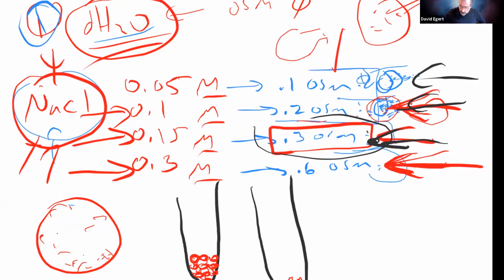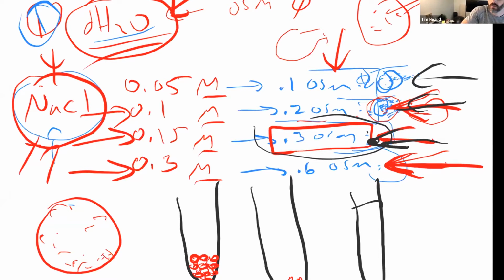And again, how would I know, just from looking at the tube after I've spun down, that they have all exploded? If the tube is red. The supernatant would be red. And murky. Why murky? Just from the remnants of the membranes. They're clear, you wouldn't really notice it. So not murky, but just kind of clear.